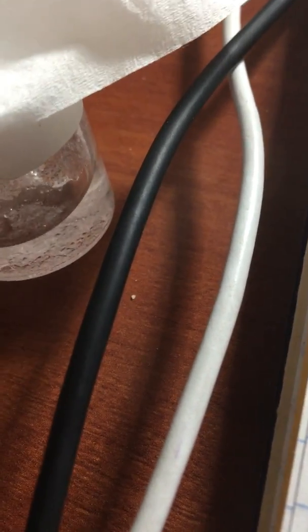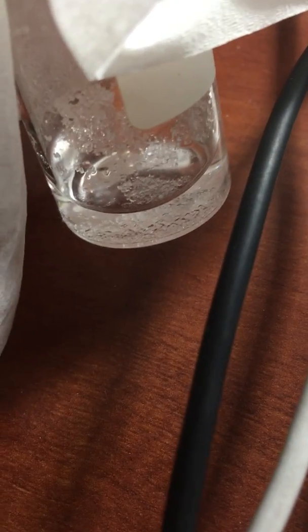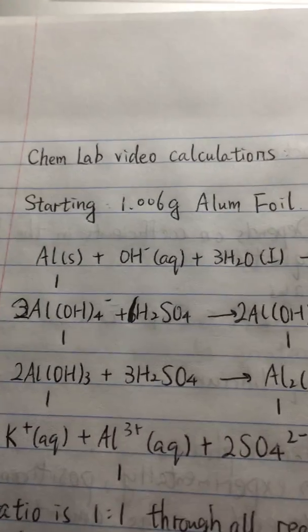So yeah, now I'm gonna talk about the percent yield of the experiment. First, I'm gonna talk about the theoretical one, and then the actual one.